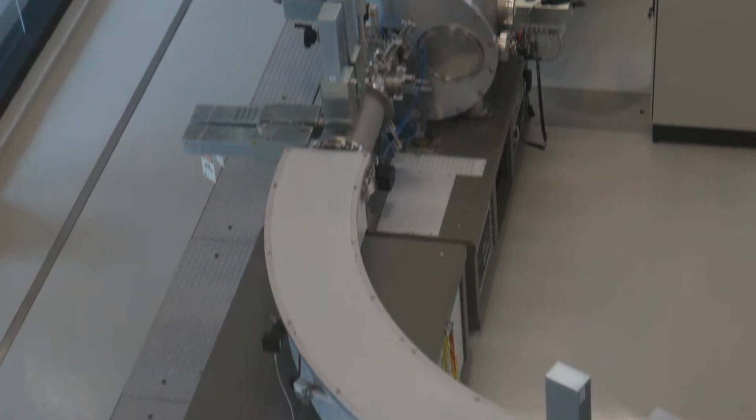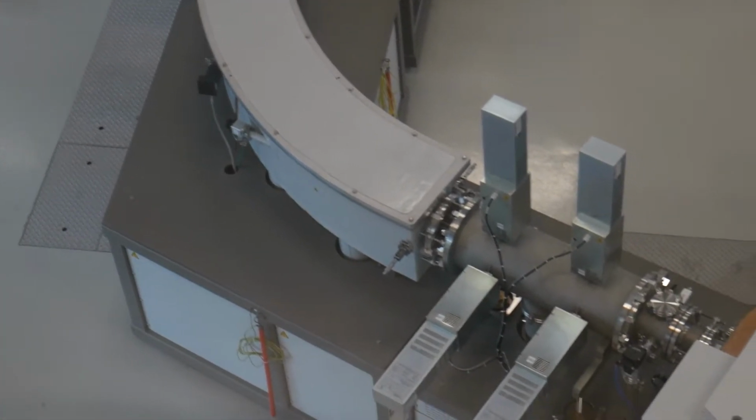When you exit into the high energy side of the accelerator, we have a fairly clean beam. And we have our 3 isotopes of carbon that are going through separately. They're being bounced through one at a time. 12, 13, 14, 12, 13, 14. The carbon 12 and 13 are abundant isotopes. They're the stable isotopes. Carbon 12 is the one that you see on the periodic table because over 98% of all carbon is carbon 12. So it's the most abundant. Carbon 13 is not nearly as abundant as 12, but it's still much more abundant than carbon 14.